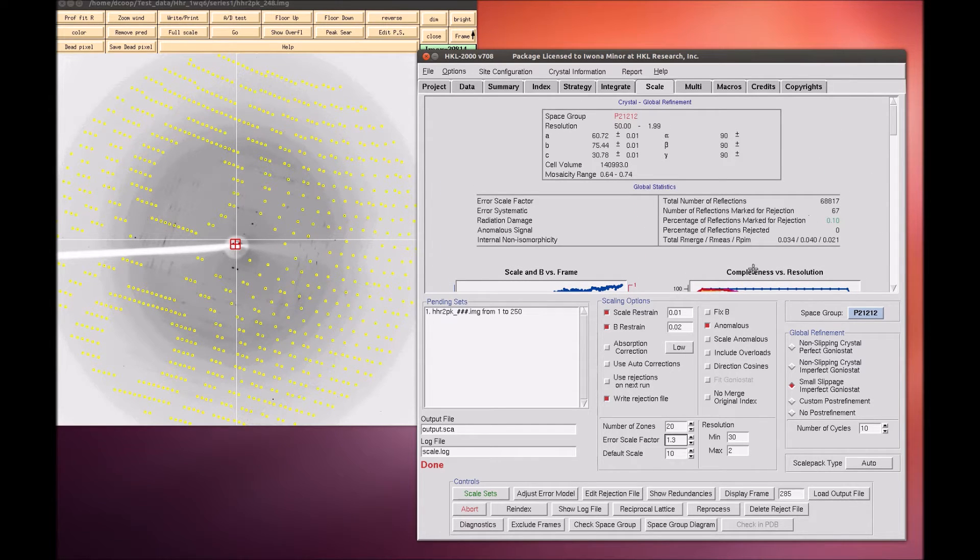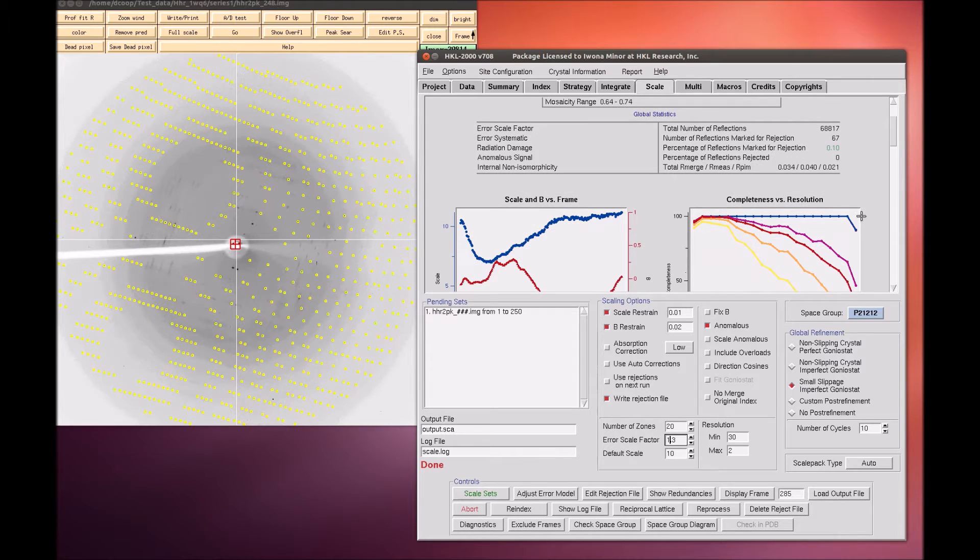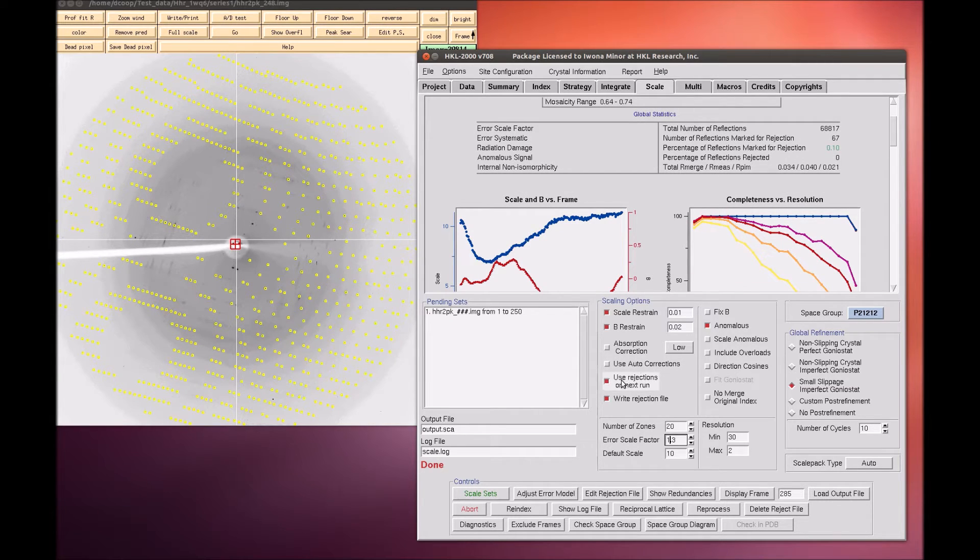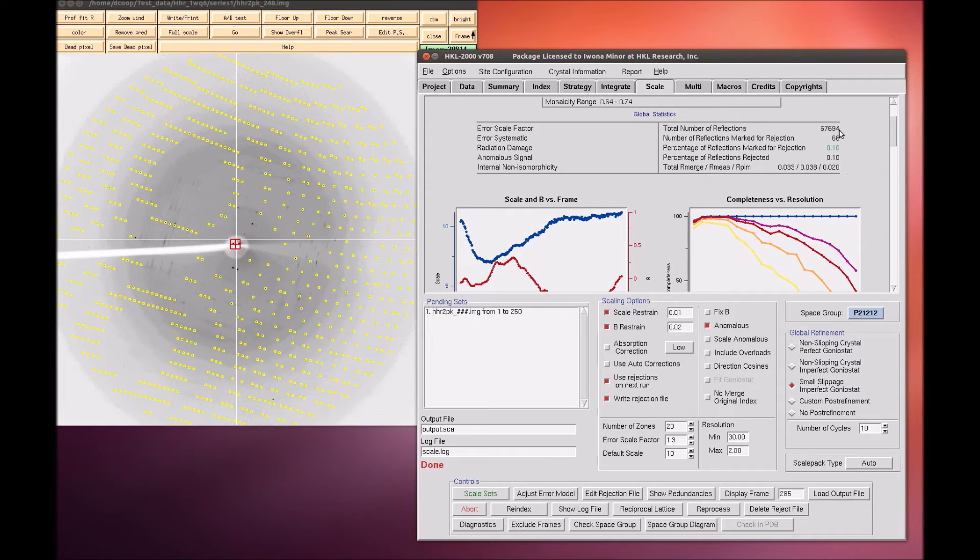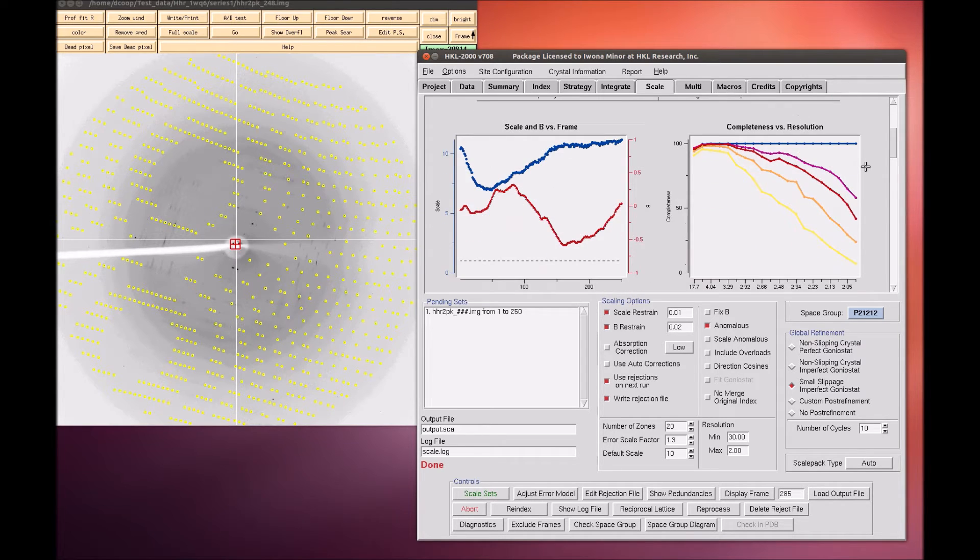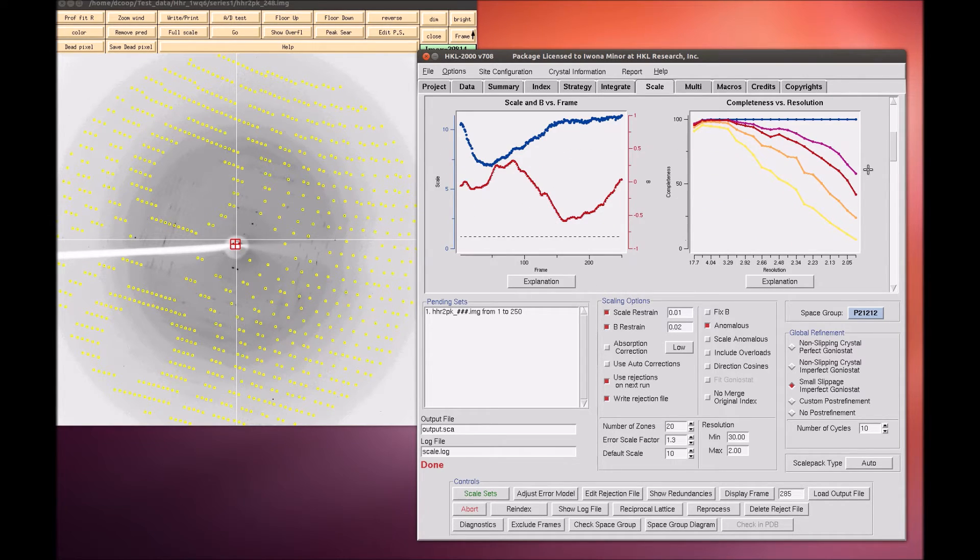Once the data has been scaled once, some reflections will probably be flagged for rejection. Select Use rejections on next run to exclude these reflections from the scaling process. Scale the data a few times until the number of reflections marked for rejection stabilizes and the global statistics are also stable.